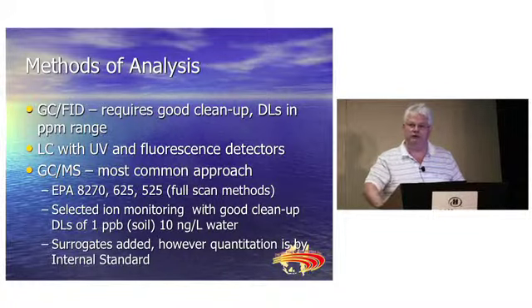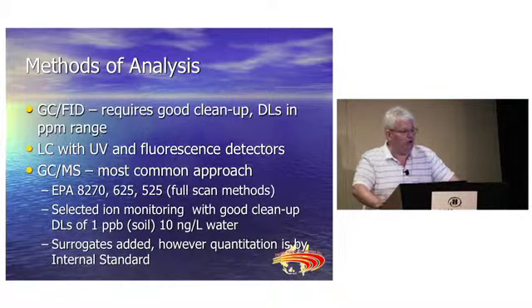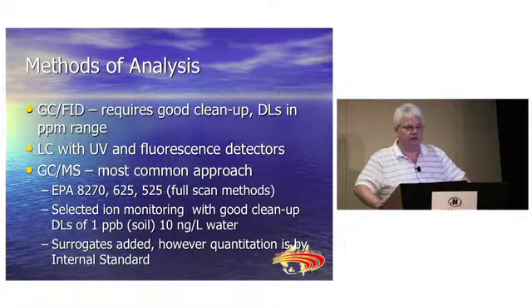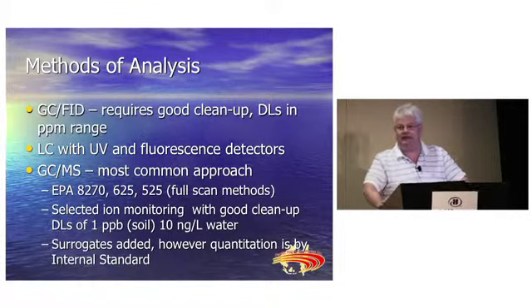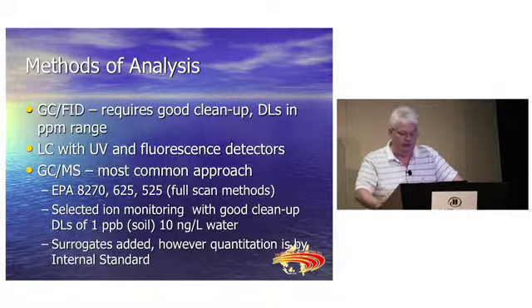I've been doing PAH, I hate to say this, since 1980. When we first started, we did them by GC-FID. We'd extract the sample, we'd clean it up. I can remember using a benzene methanol elution on a Sephadex LH-20 column. I don't know if any of you still use Sephadex LH-20. These days it's usually just extract and inject. But it is possible to analyze PAH, certainly at the ppm level, on a GC-FID.